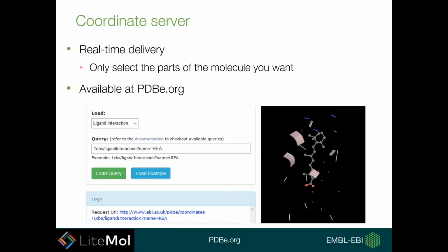The coordinate server is something else that has been developed alongside Litemol, and this is another added improvement on Litemol to add real-time delivery to what you're seeing. So it only takes the bits of the molecule that you want to look at and displays them for you. And if you want to find out more about how you could use the coordinate server, for instance, at looking at ligand binding sites, you can see this at pdbe.org.